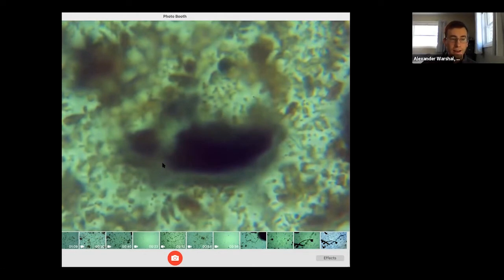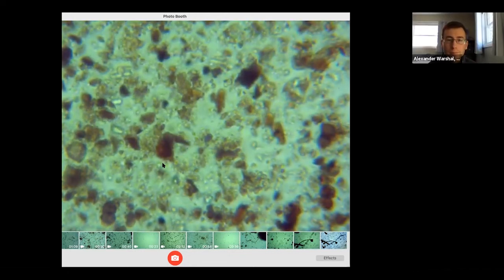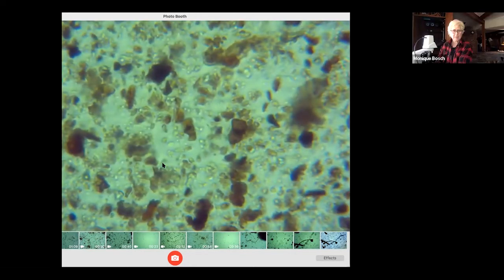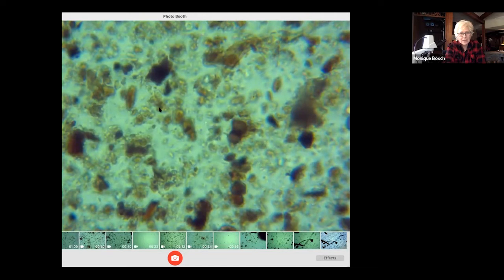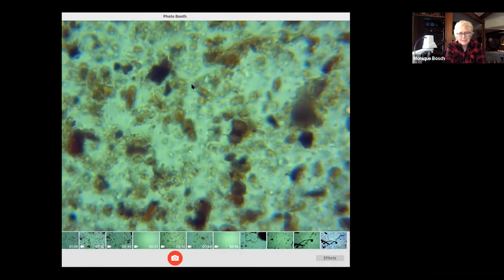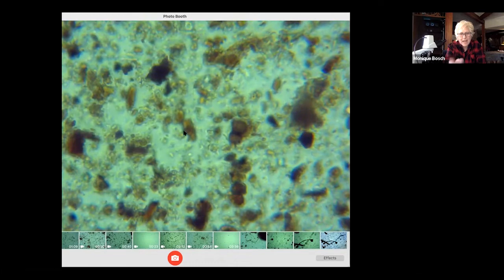Monique, Glenda Neff asks if you can use your cursor to point out quote unquote organic matter. Certainly. Okay, so here we are. Organic matter in this image, see this? Anything that is not, like these are aggregates and you can tell that they're made up of other things. But when you see things like this, you can probably see better when I zoom out, that's organic matter.